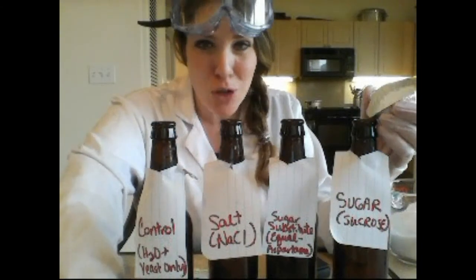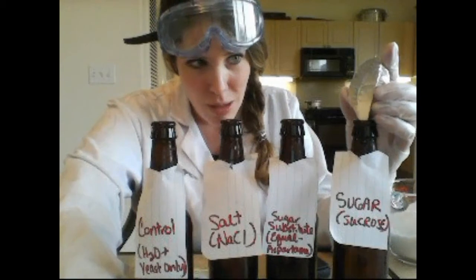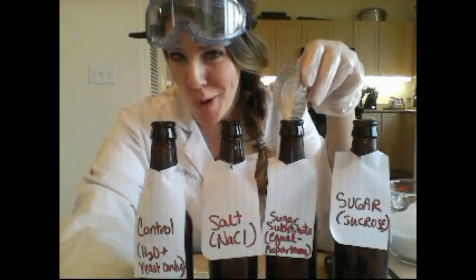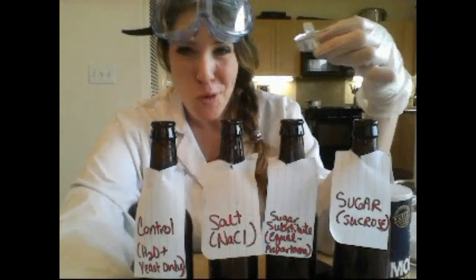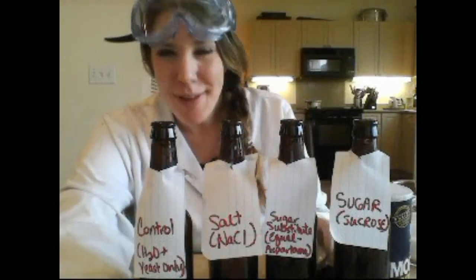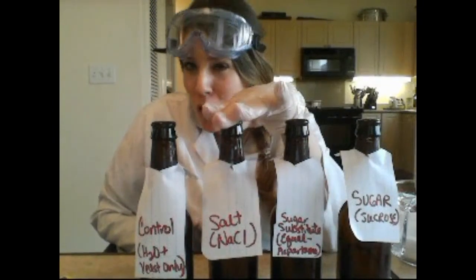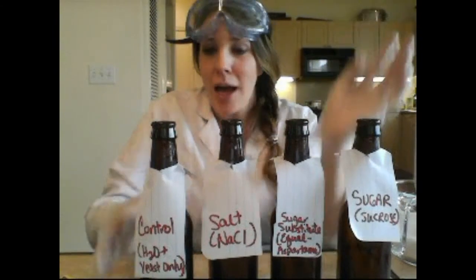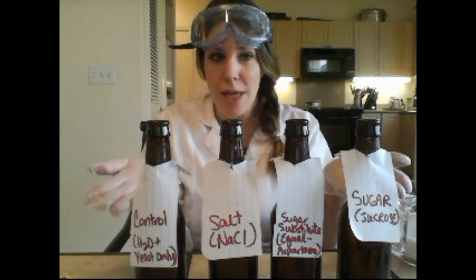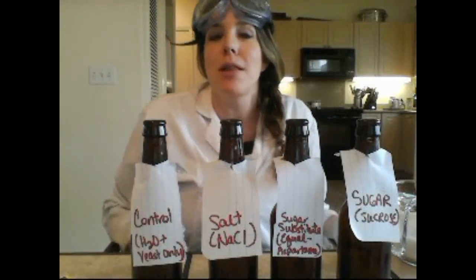Here goes 4 grams of sugar into the sugar bottle — try to be careful not to let it spill. 4 grams of Equal into the sugar substitute bottle. 4 grams of salt into the salt bottle. Now each bottle has 7 grams of yeast and 4 grams of their respective substance, except for the control which just has yeast.